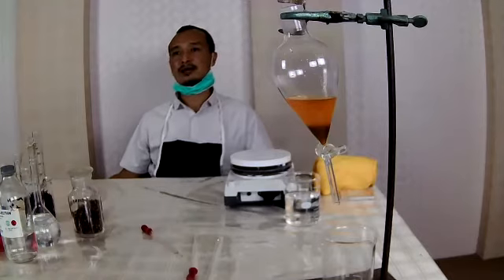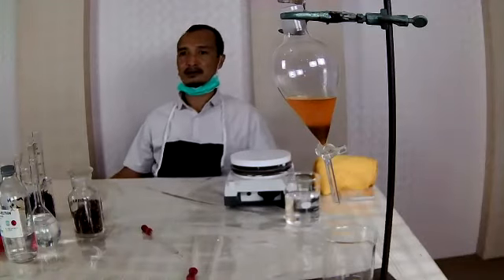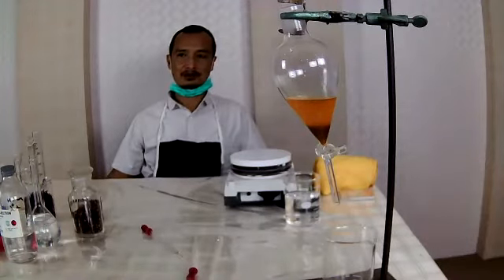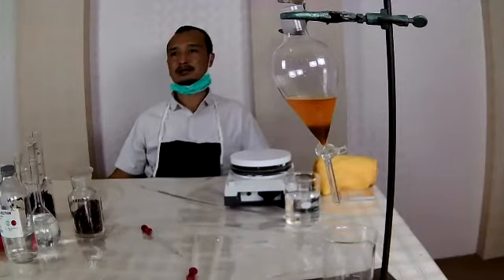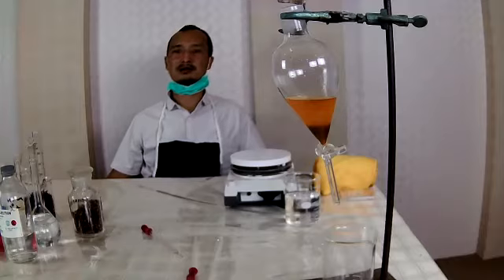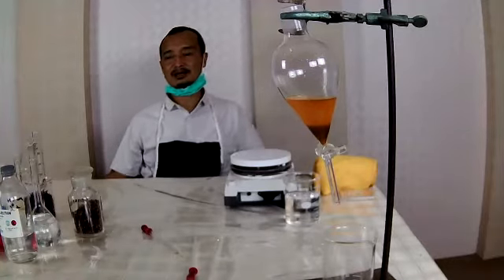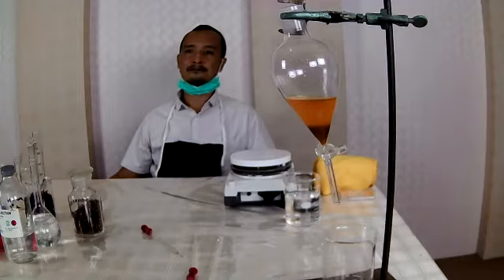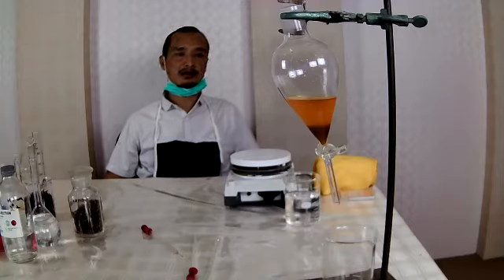And we can also do some chemical analysis here on the solution or the products. We can use the NMR or GCMS, gas chromatography-mass spectrometry, and we can learn more about the extraction.